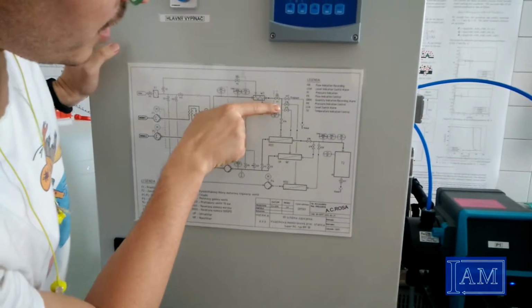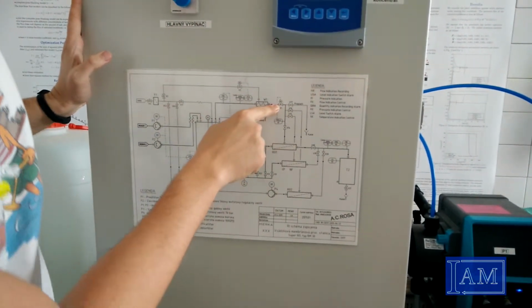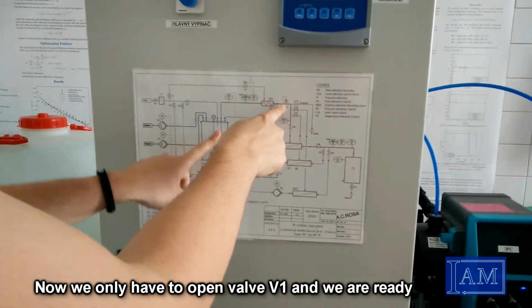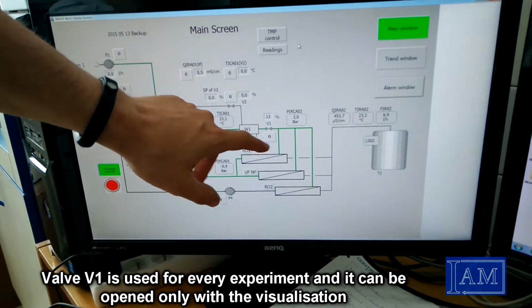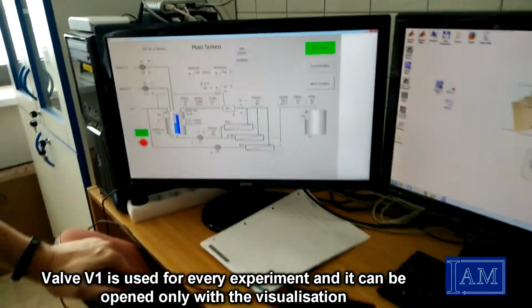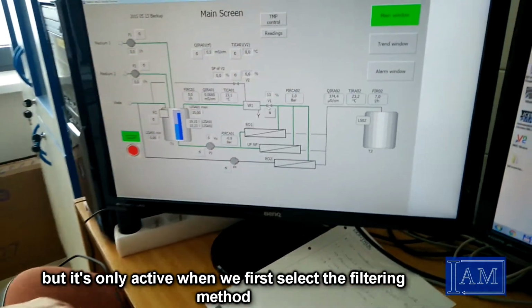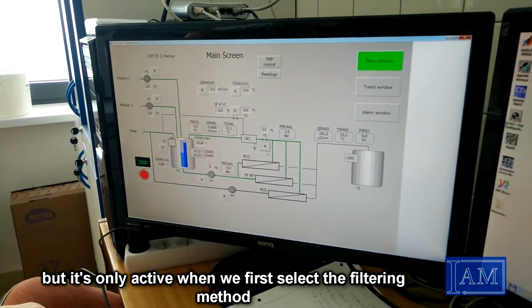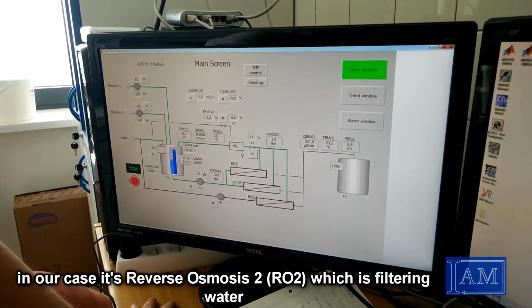Valve V14 is used for a different filtering method. Now we only have to open valve V1 and we are ready. Valve V1 is used for every experiment and it can be opened only with the visualization. We can open it electronically. It's only active when we first select the filtering method.